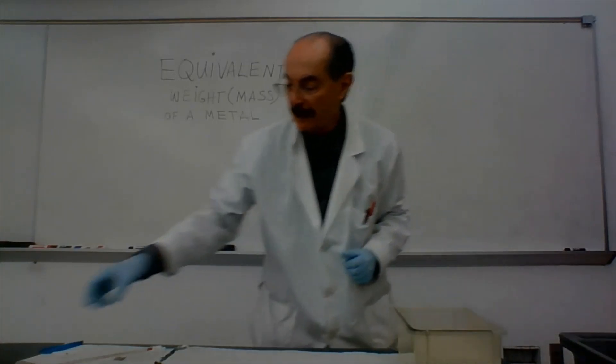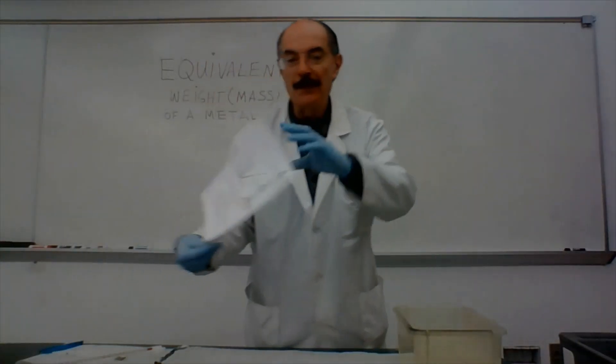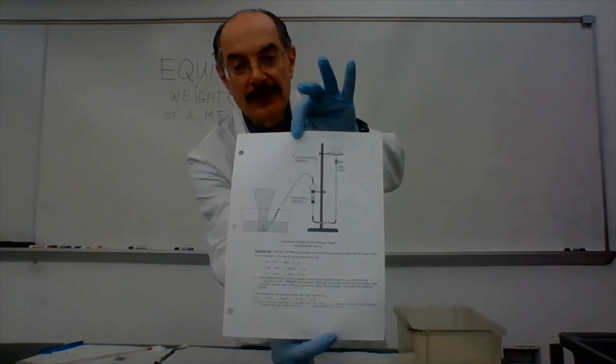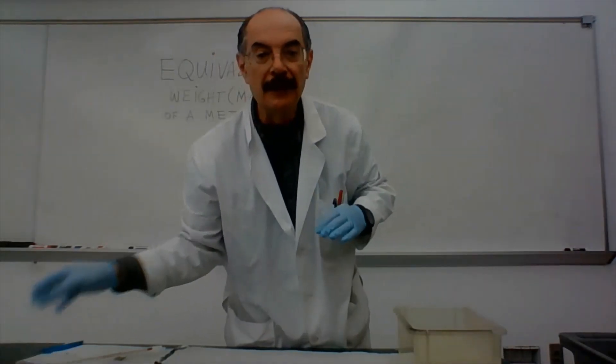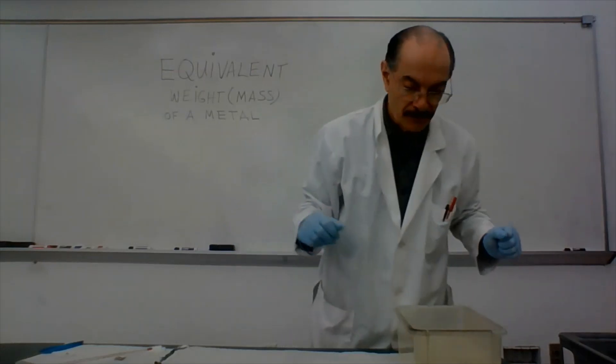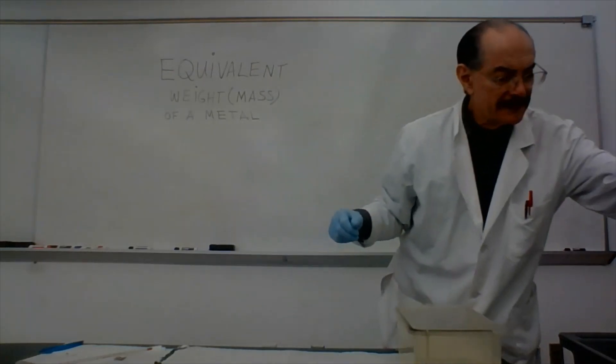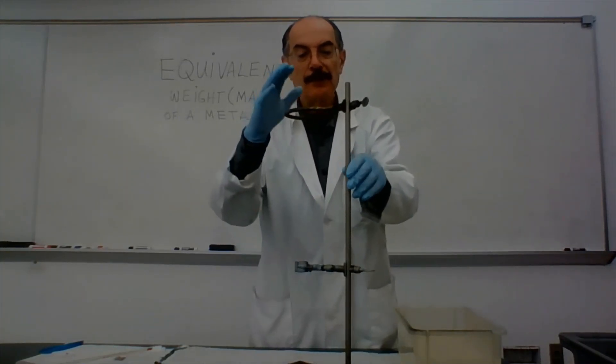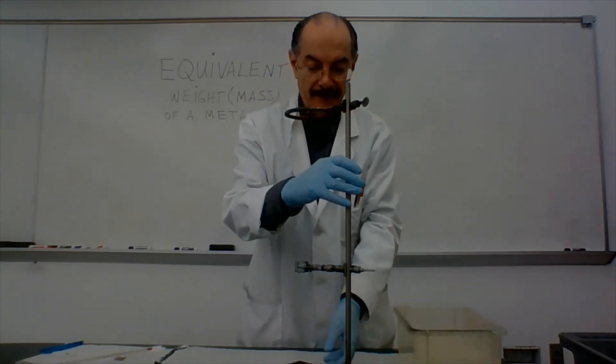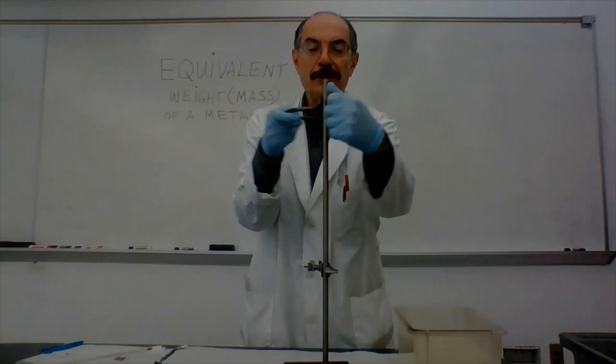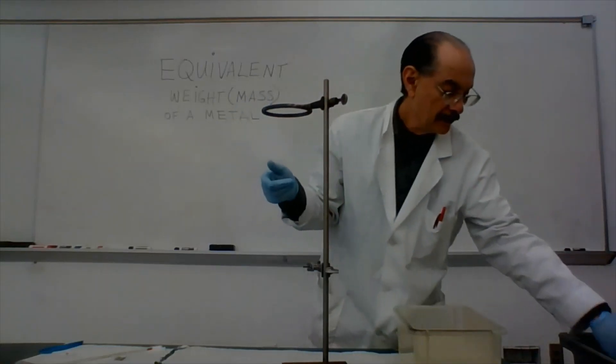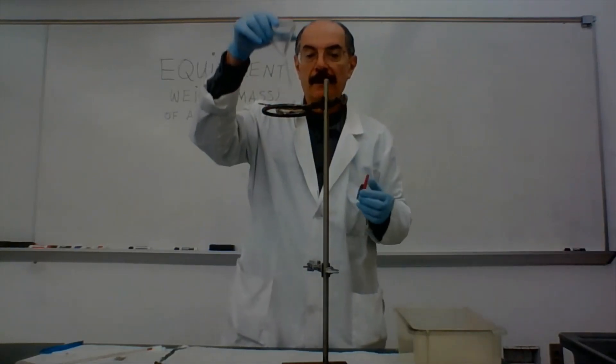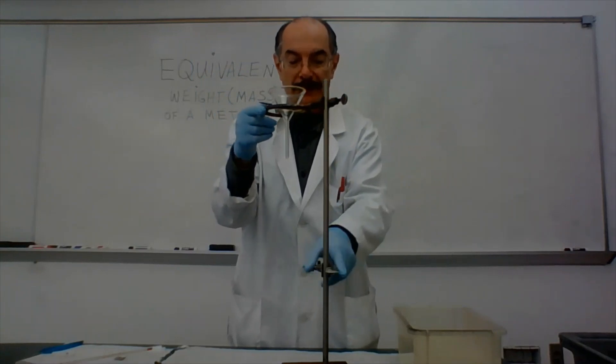Now what you need to set up is the following. This is the apparatus that you're going to set up. It's on page 20 of your lab manual, so you might want to refer to that picture as we walk through the following set of demos here. You need to get yourself a ring stand. And on the ring stand, you're going to put a clamp and you're also going to put in an iron support ring. The iron support ring will also require you to put in a clay triangle. And on it, we're going to put a glass funnel and that will hold it in place.